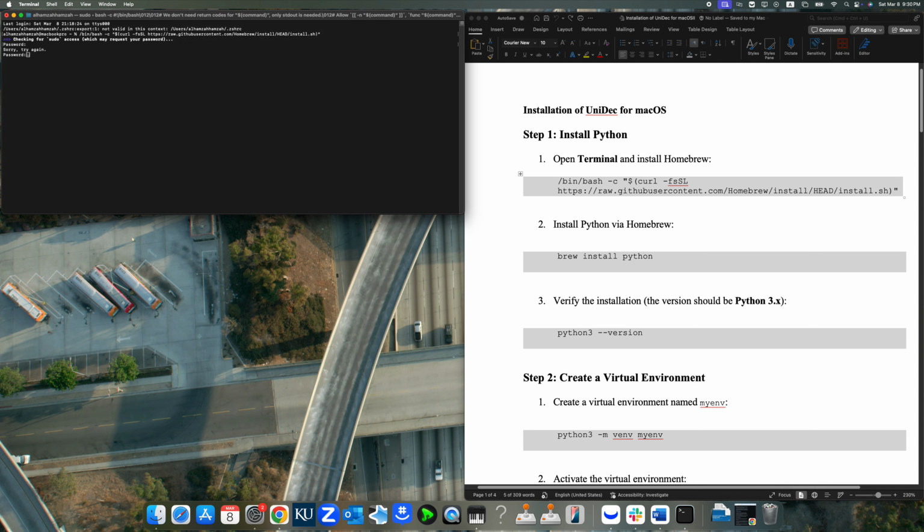Oh my god, I don't know my password. That's weird. Okay, let's try again. There we go. It should work.